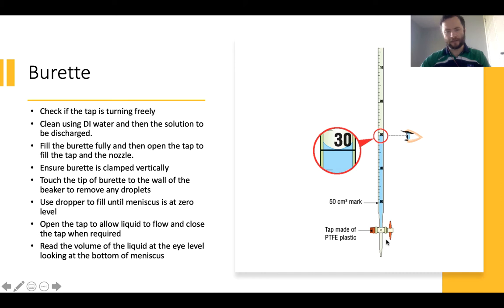Then the burette needs to be cleaned. First of all, using water just to remove all the impurities on the wall, and then we have to rinse it with the solution of the chemical that needs to be discharged, so that when the burette is filled, the concentration of the solution is not changed.